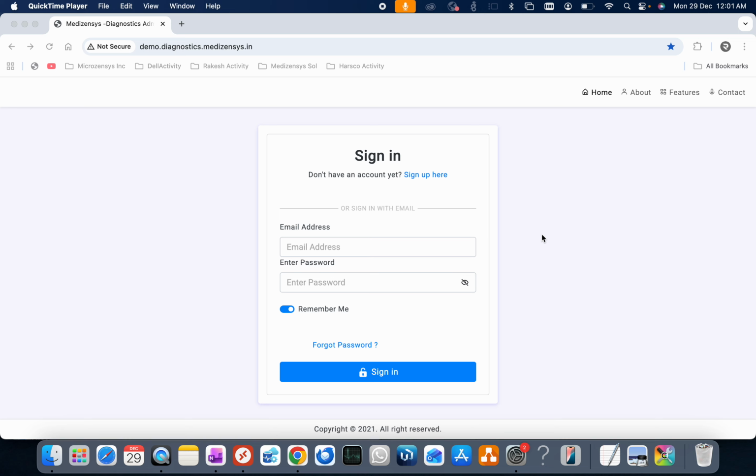In this video, I will show you the newly onboarded diagnostics management application. From this application, you can manage your regular business operations for your diagnostics and lab center. In this video, we will show you invoice generation, test reports, test processing, sales collections and sample collections. So how do we automate all the flows? I will show you right here.